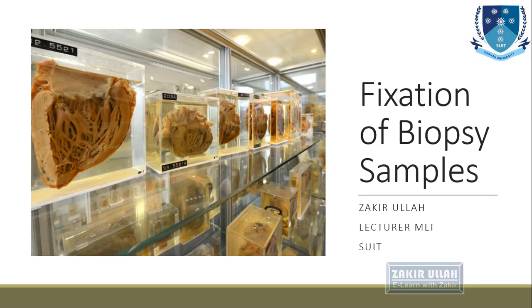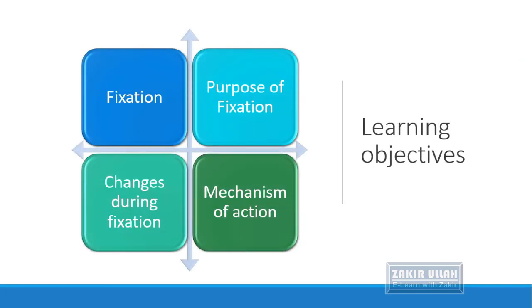This is Zakirullah with a new topic, fixation of biopsy samples. In this lecture, we will learn about the process of fixation, what is the purpose of fixation, and what is an ideal fixative. What are the different changes which occur, or the possible changes which occur during the process of fixation, and we will also learn about what is the mechanism of action of the fixative and how the process of fixation occurs and what are the different steps that take place in the tissues.